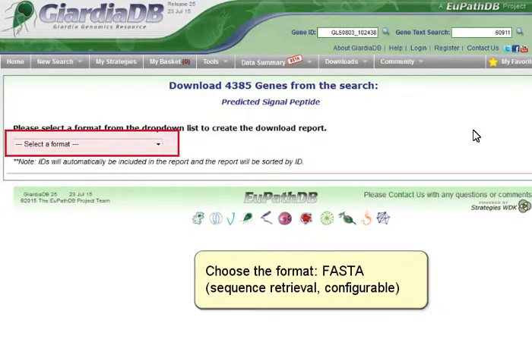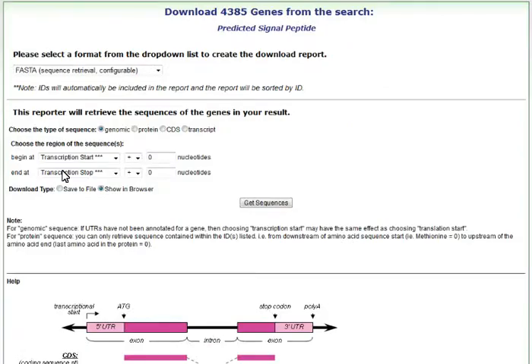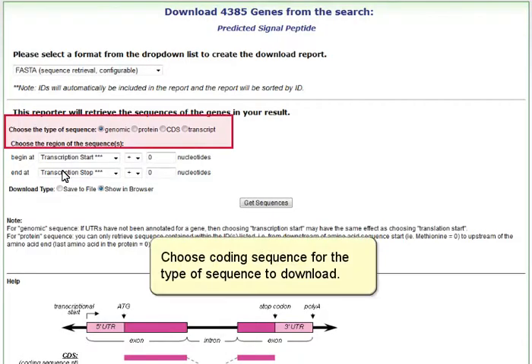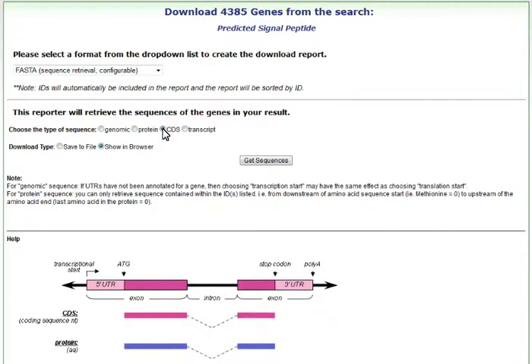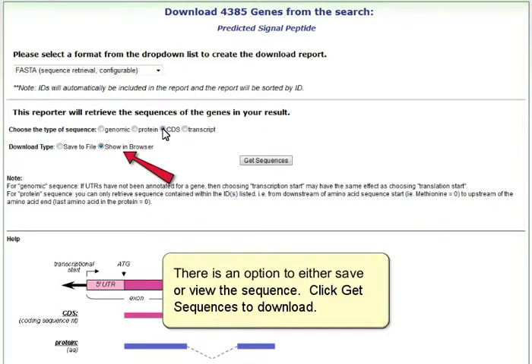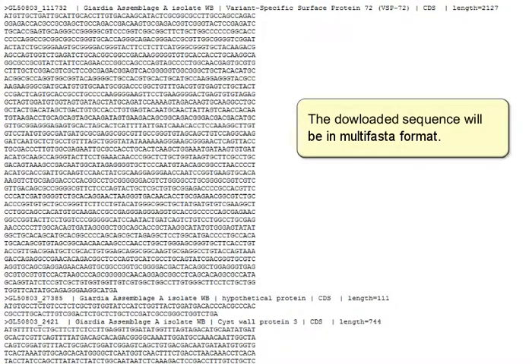Click Download Genes to choose the download settings. Choose the format FASTA, Sequence Retrieval Configurable. Choose Coding Sequence for the type of sequence to download. There is an option to either save or view the sequence. Click Get Sequences to download. The downloaded sequence will be in multi-FASTA format.